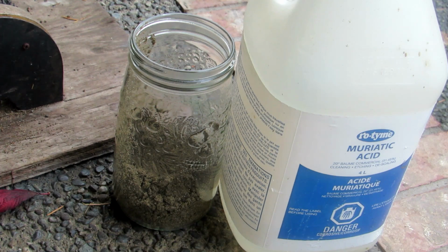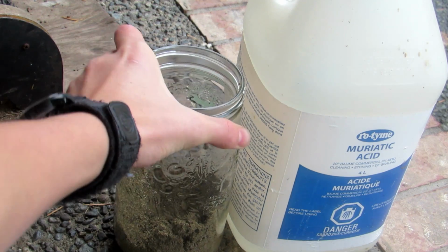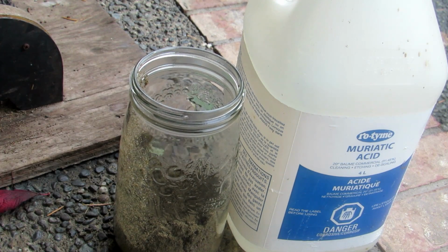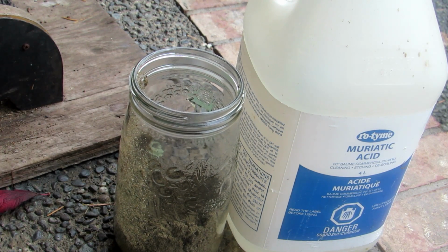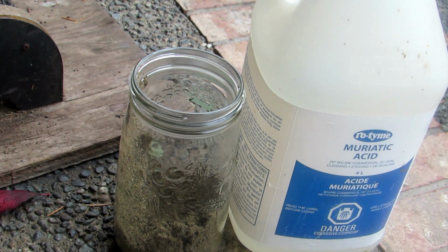So, what I have here is just a fair amount of sand. It doesn't really matter how much you use, but it's just from the beach, and it is wet, but that's okay. We also need some hydrochloric acid. This is muriatic acid, which we picked up at Home Depot. And this hydrochloric acid is first going to dissolve any impurities such as iron oxides and calcium carbonates from seashells to make our sand a bit more pure before we go ahead to the next step.